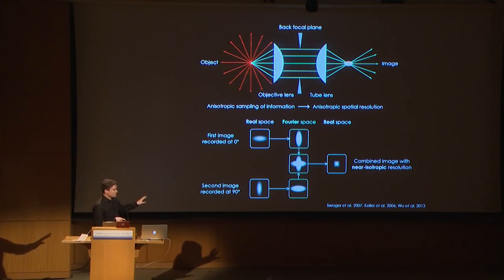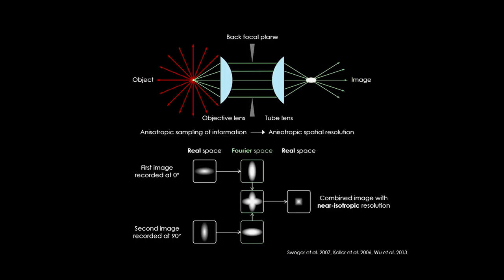So that would be a powerful way to improve spatial resolution, because we can just keep our microscope and the way in which we build our light sheets the way it is. And basically the main challenge that we have to solve now is to find a way to record these multiple views at the same time. Then we haven't sacrificed temporal resolution. And so Raghav Chitty, a postdoc in my lab, addressed this problem and built a microscope that can do that.